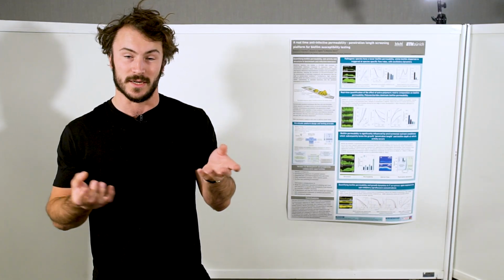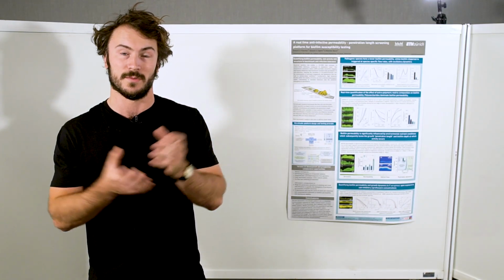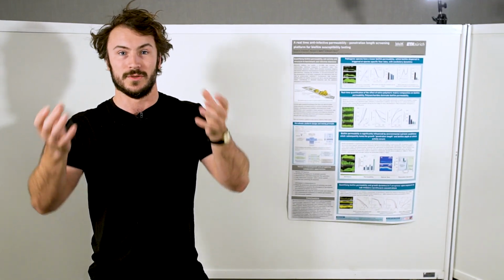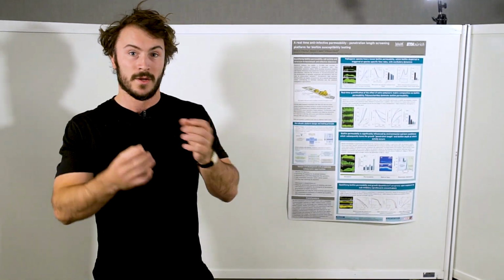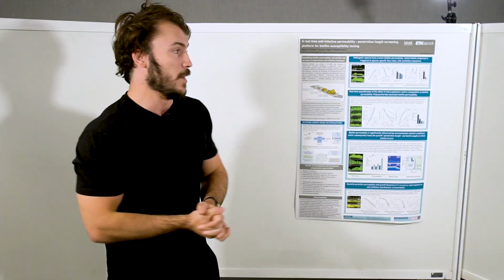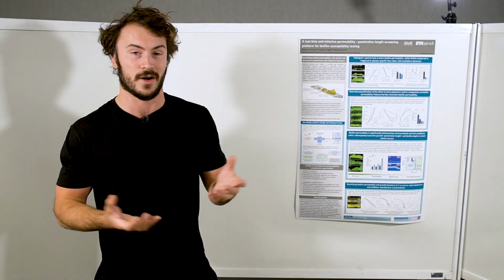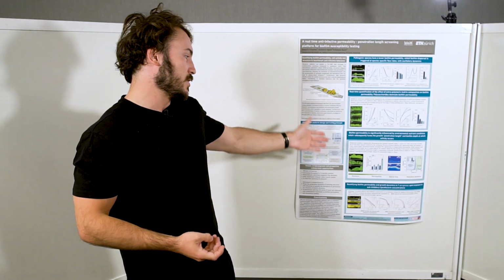And the way that we accomplish this is through a microfluidic technology, which we've been working on over the past couple of years. This involves the formation of porous membranes within a microfluidic channel. Then what we're able to do is seed these membranes with an inoculum of cells. The density is the investigator's own decision. And then we track biofilm formation with time within this localized area. And the poster here today is giving you a very solid idea of the fundamental applications of the technology on model systems.